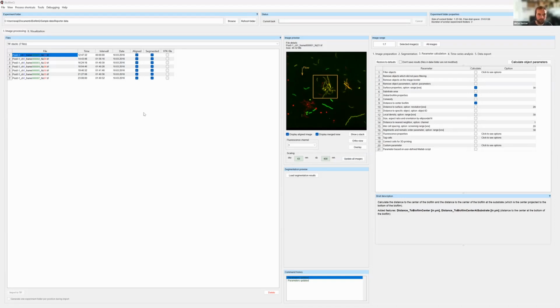Maybe to add, it always depends on the accuracy that you want to have, right? If you just want a coarse segmentation of your biovolume and just want to know coarsely how much is there, then it might be fine to do an automatic one.